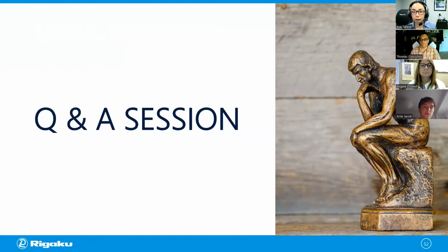He's asking, how does the integration time increase the resolution? I'm not sure if that is specific enough for you to answer, Aya, or if you need more details. I understand that question, I think. So let me answer it and see if I get this right. That's a very good question because it's not obvious, right? Just spending longer time is not going to change your resolution. You change the resolution in the scan condition settings.